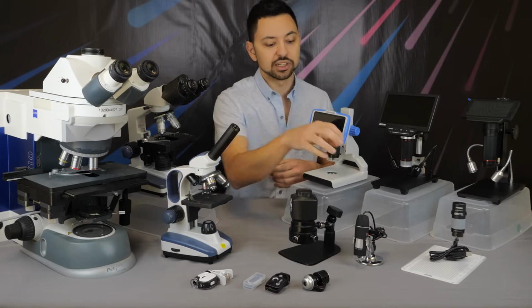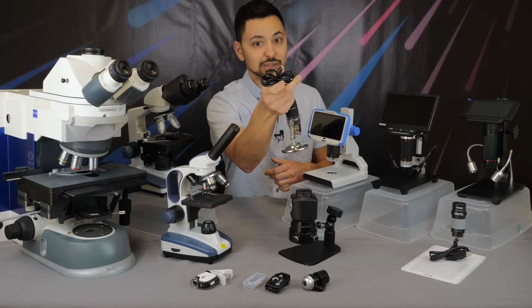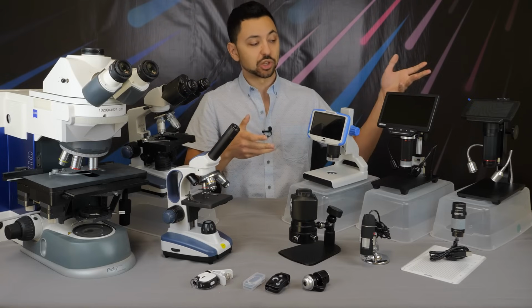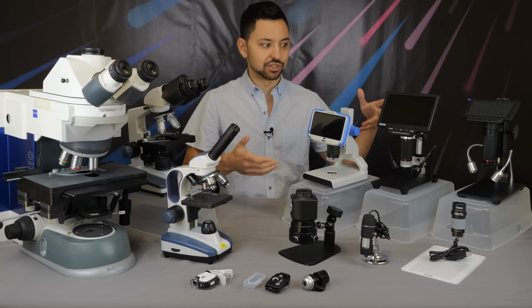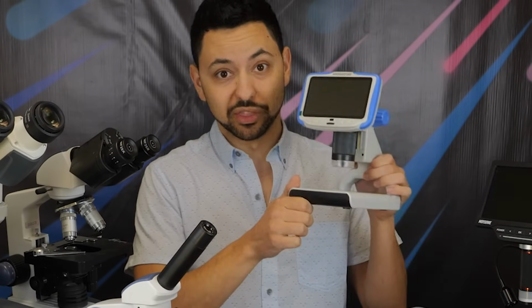If you want to get full HD viewing on a microscope, you are going to need to upgrade to a microscope that is either blue on the inside, because that means that it is USB 3.0, or you're going to need to get an HDMI microscope or one of the microscopes that have these screens on them. These screens are, as far as I know, all actually 1080p screens, so the resolution is basically as good as your phone's screen.